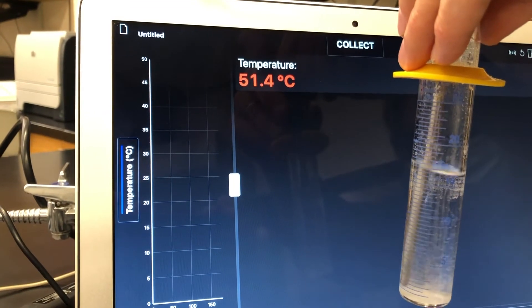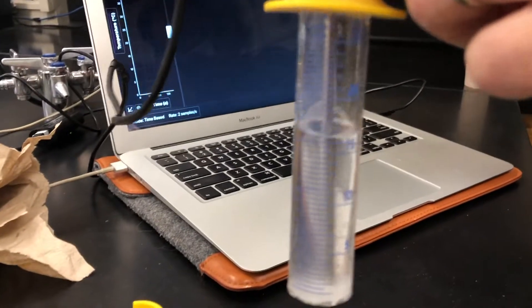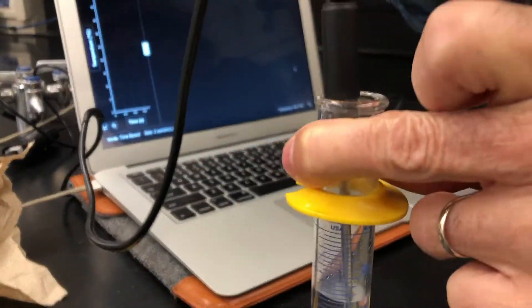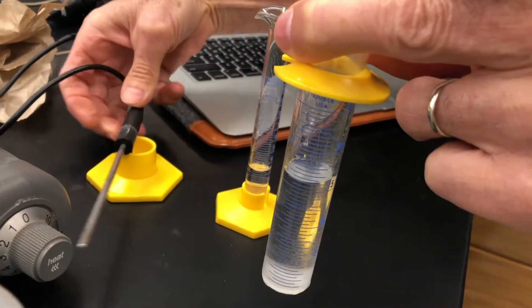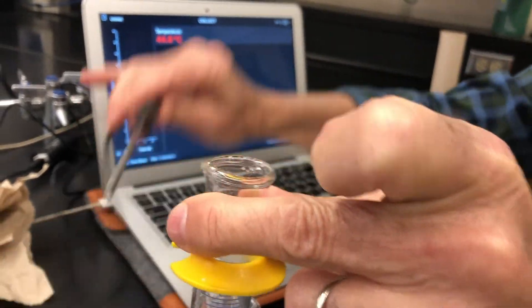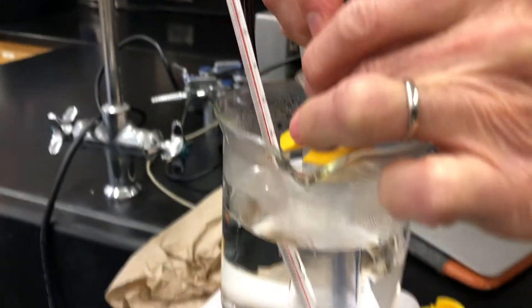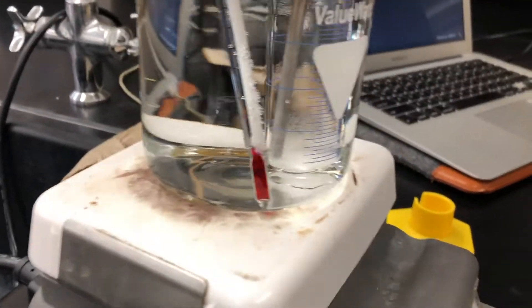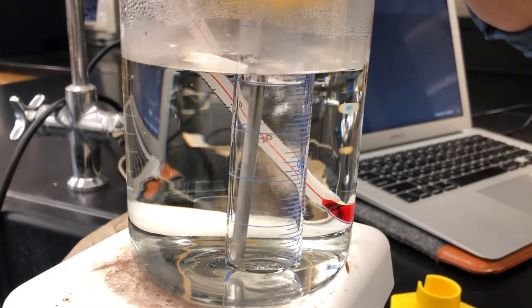We can pretty confidently say we're now past the point where crystal formation occurred. So we're going to repeat again: remove the temperature probe, add about three milliliters of distilled water. Same amount of KNO₃, a little bit more water, a little bit lower solution concentration, so a lower temperature is needed to get everything to dissolve. Heat it up, stir, and dissolve.